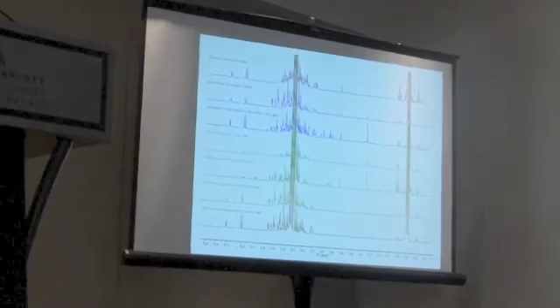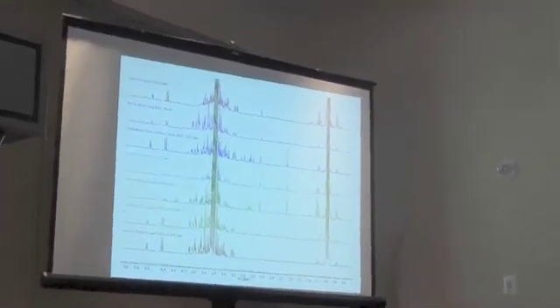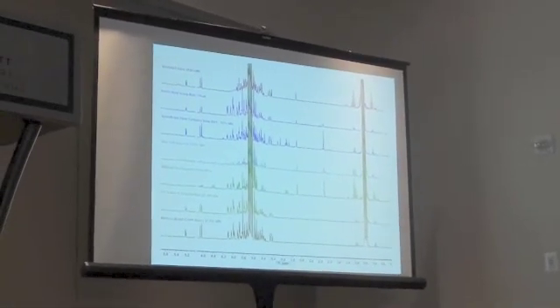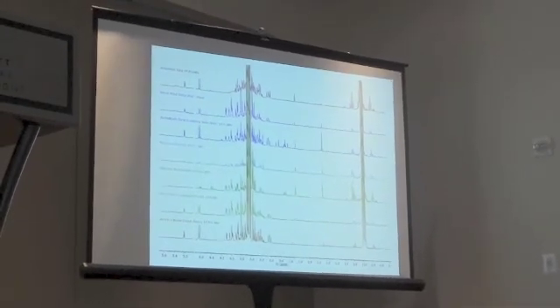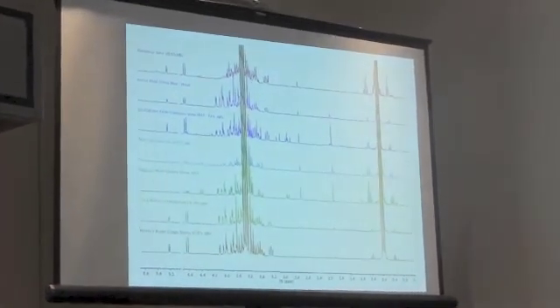But if you could freeze dry that, you'd then be looking at another region of the spectrum out here, where all the polyphenols are and things like that. You might see a lot of character there, I think. A lot of mass spec people are doing that. But mass spec is not really quantitative, and when you do it quantitatively, it costs a fortune.